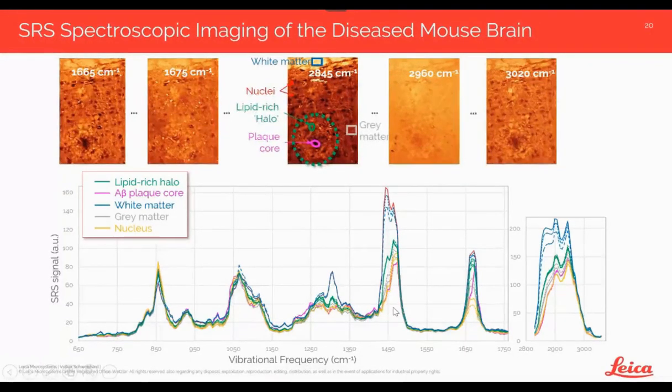And you can appreciate how different those biochemical structures look in those spectra, especially in certain regions. So in the next slide, I want to focus on just one of those vibrations, namely the amide-1 vibration associated with proteins, which is overlaid onto a CC double bond stretch of the unsaturated lipids in this sample.